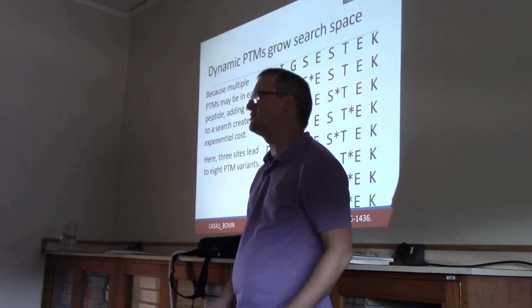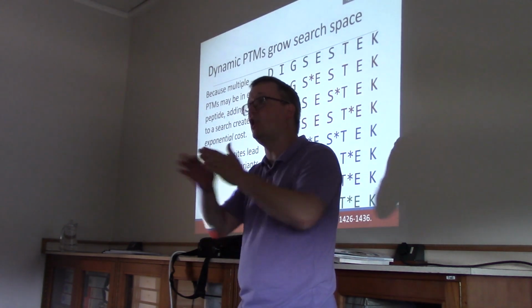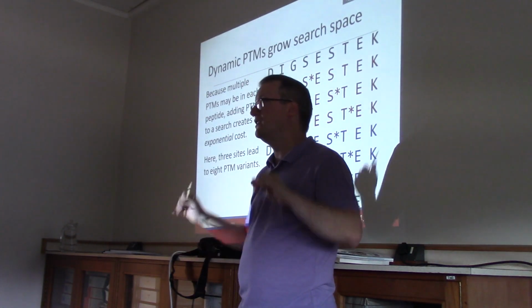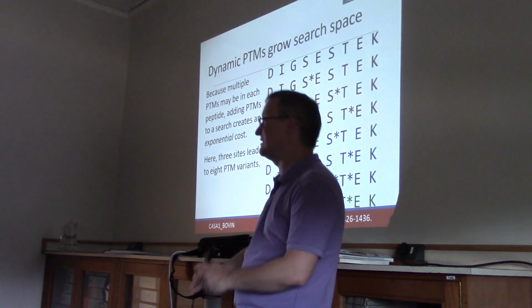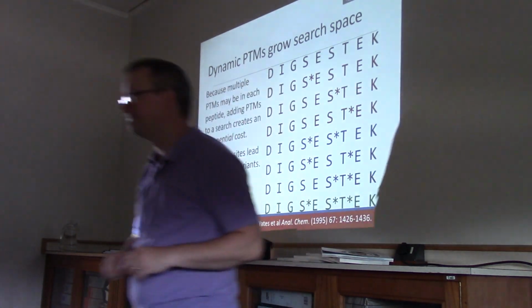I brought in some math, I'm sorry, but it's helpful to be able to model this. Essentially, the longer the peptide you've got, the more modifiable residues it's got, the greater the likelihood that you're creating this blast of different possibilities as you allow for modifications.